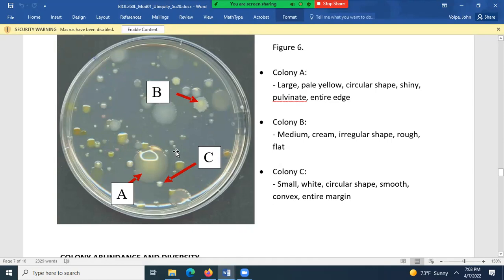But if you were to tell me something like 10, and I counted 7 in diversity, that's okay. But if you say the abundance is 100 and the diversity is 50, I would say the abundance is okay, but the diversity being 50 is too high. Because this one and this one, and then this one and this one, and that one, those are all the same.